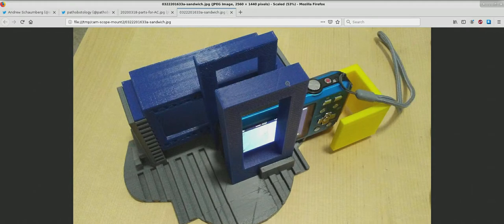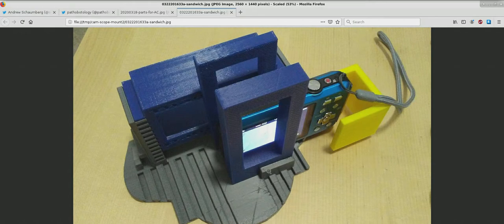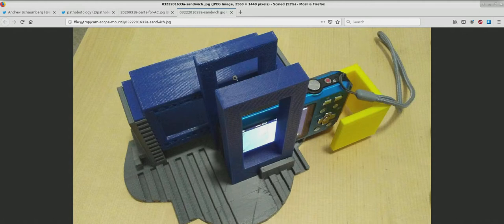Then your other bumper, or one of your other bumpers, can be placed on the other side. Finally, there's this small locking part that fits in snugly to tie everything together. So in effect, you have a camera sandwich.